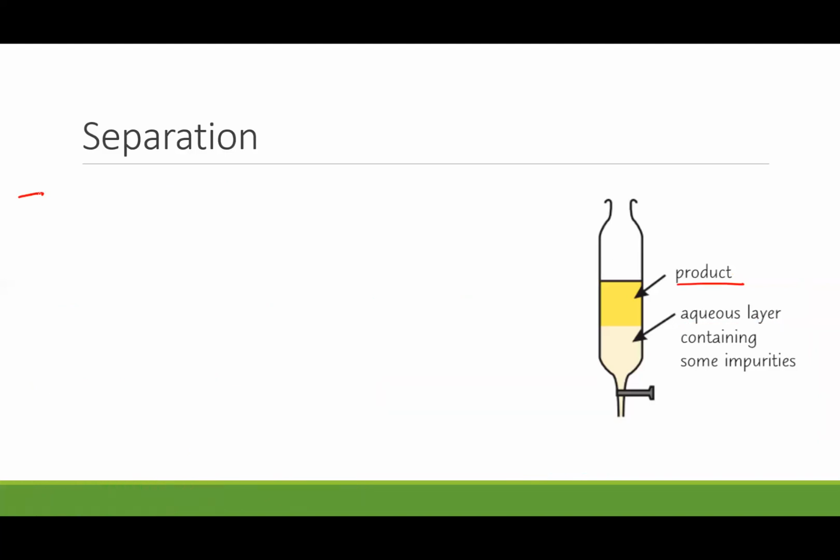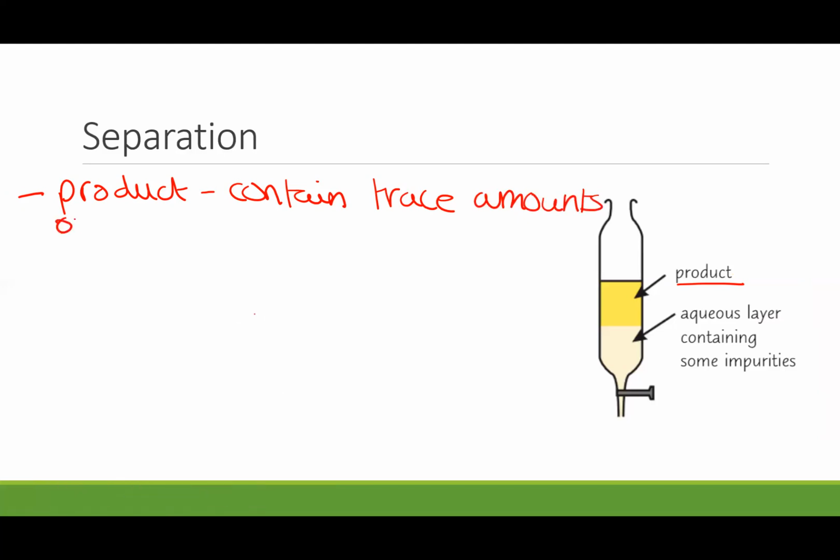So our product is going to have some trace amounts of water. That will stop it from being as pure as we would like it to be.